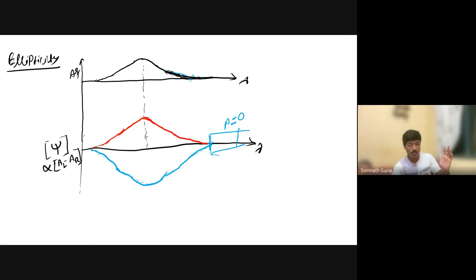First of all, the molecule has to absorb at that wavelength, which should match the transition where the electronic transition can happen, and in that transition the magnetic moment will be active. So all those we actually covered.